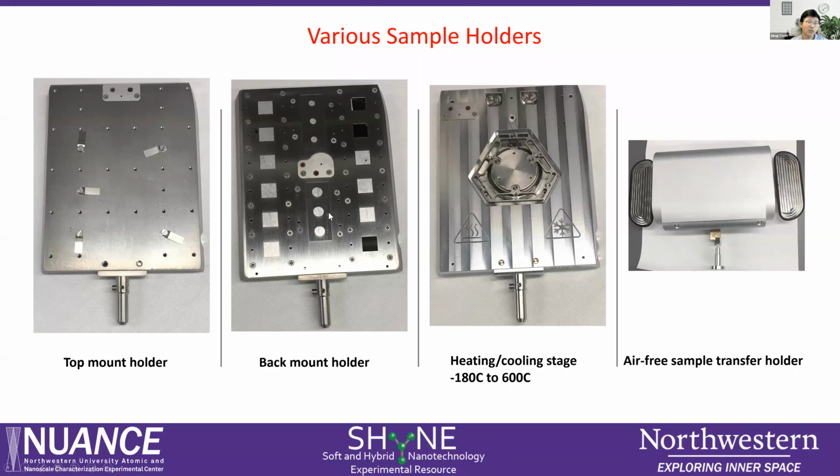And so this is a back mount. This is more safe. And we use a backside mount the sample. We can mount like this 12. And here also we can mount the small sample here. And mount this one, they call the back mount and the sample holder. So this one is use heating and cooling. And this temperature range from the minus 180 to the 600.